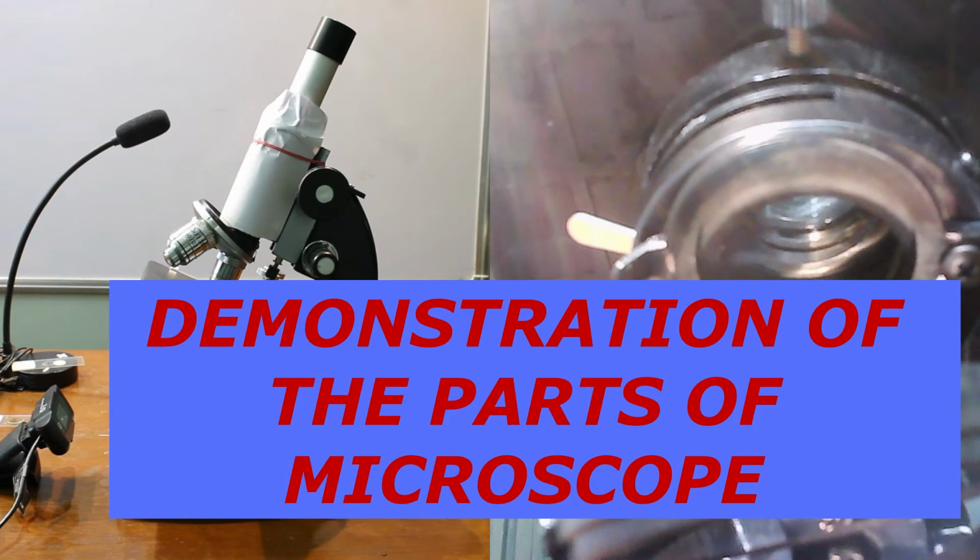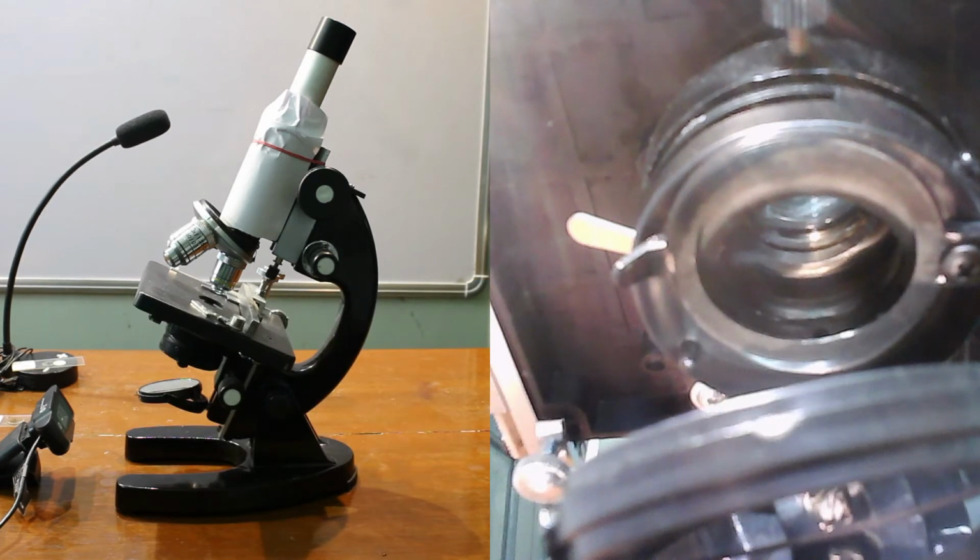In this video, I will demonstrate different parts of the microscope with their specific dedicated functions. This is the eyepiece. It can be 10x or 15x power lenses.